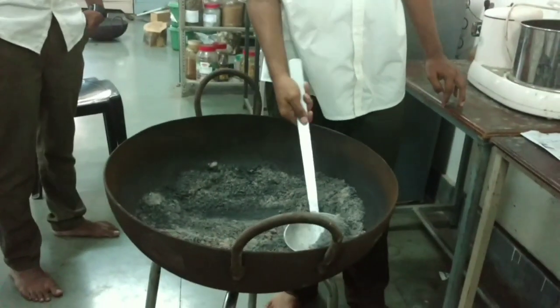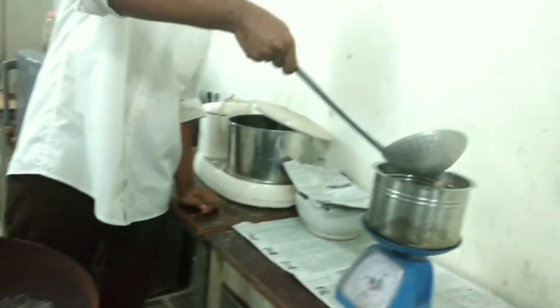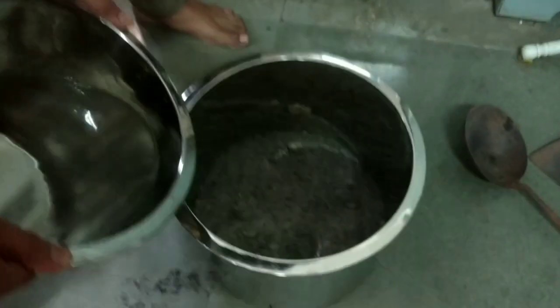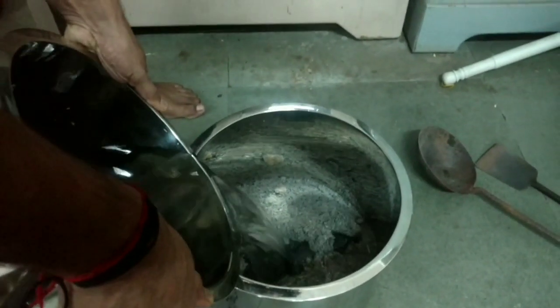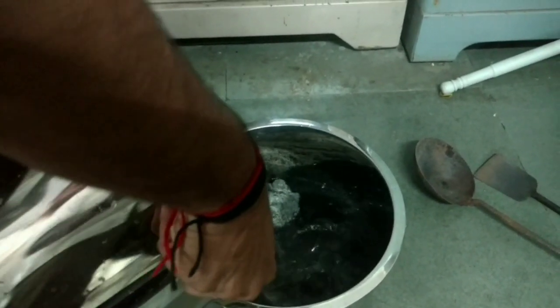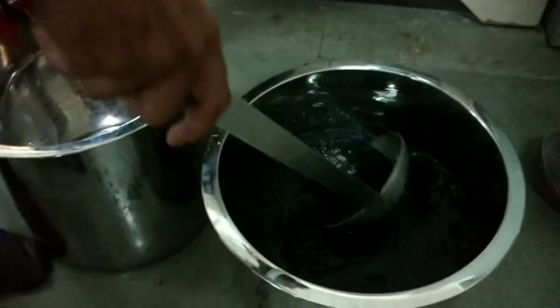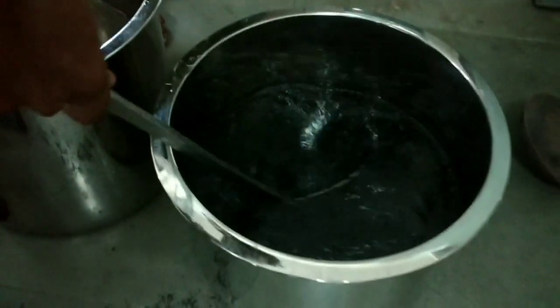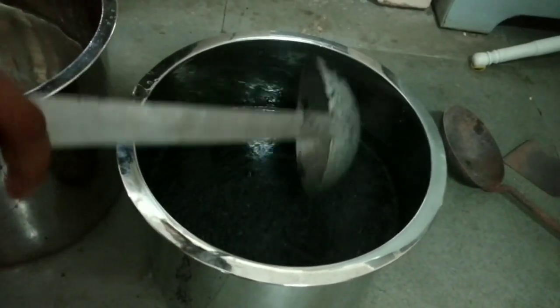Later, the ash is mixed properly with 6 parts of water. The mixture is kept overnight and double filtered through a Kora cloth.